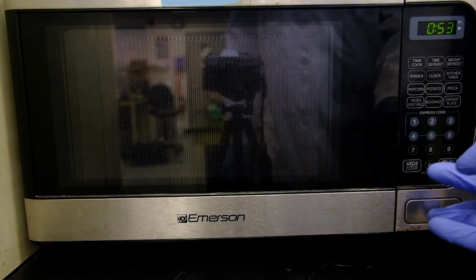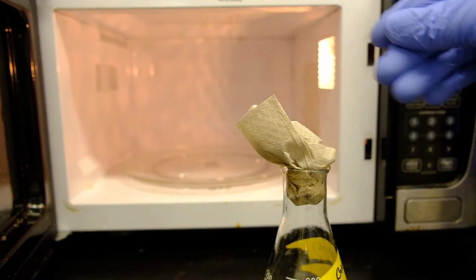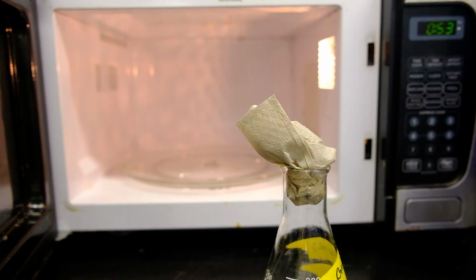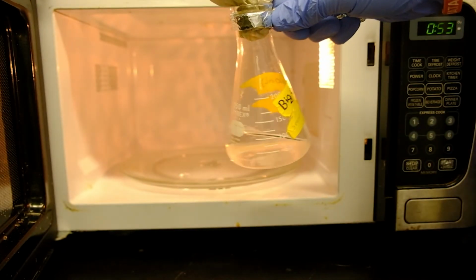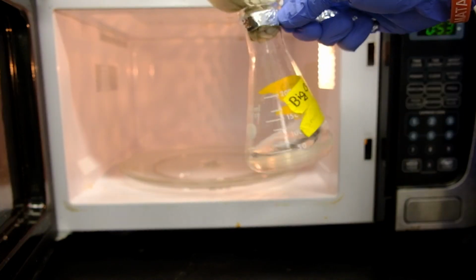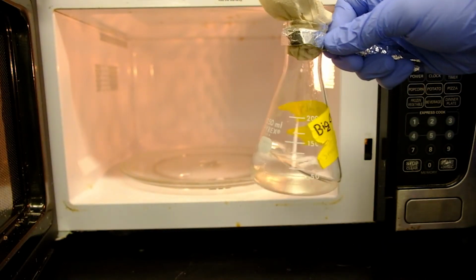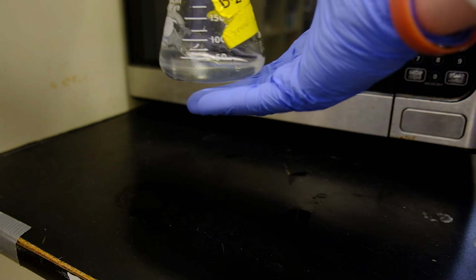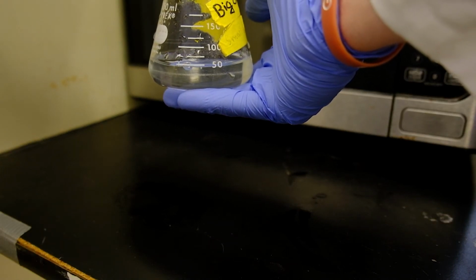You want to stop right at the point when your solution starts bubbling. Get your vessel out. Be careful, it's hot. Use heat-resistant gloves or some kind of tool to pick up the vessel, and gently swirl it until it's not too hot to touch. The solution is cool enough when you can hold your hand against the bottom of the vessel for about 5 seconds without hurting yourself.